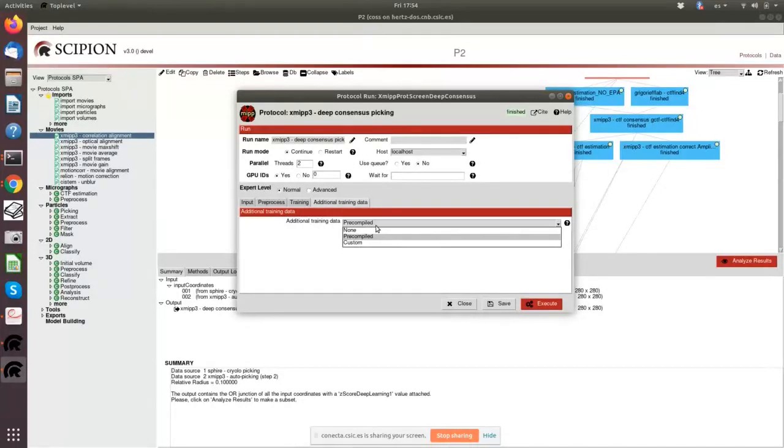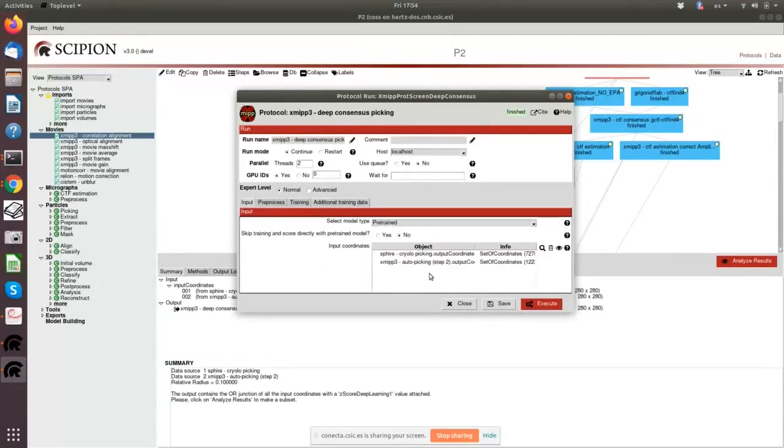We have gone over a number of data sets and found contaminations, carbon etches, and aggregations of particles, and we have selected a set of 5,000, 10,000 of these particles. The neural network is also learning to discriminate between these very bad things and the particles that have been selected by the 2 algorithms here.